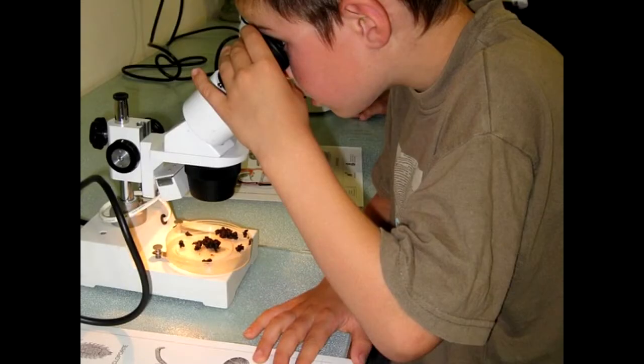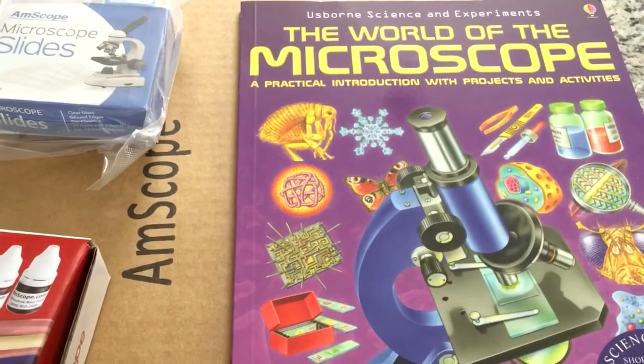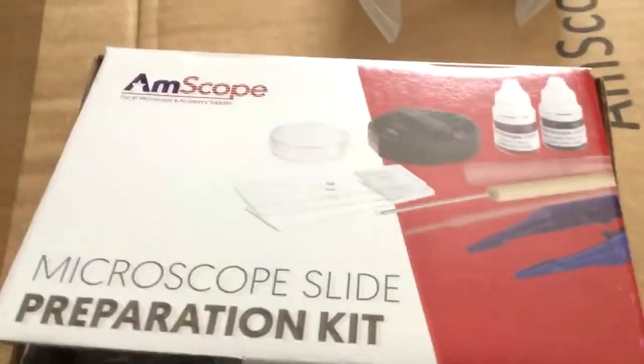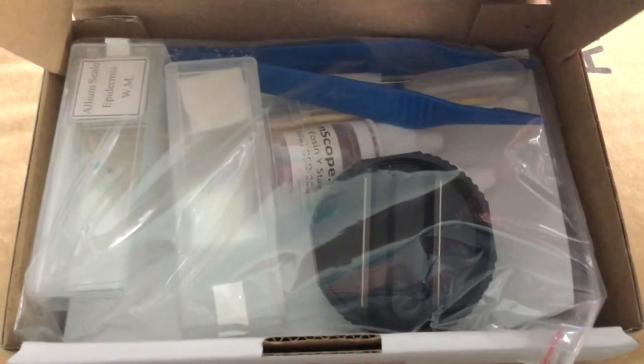You'll find regular microscopes including from Amscope in the $20 to $30 range, but it's worth it to pay a little more for something higher quality. As I record this, the Amscope M162C is $64.50. I paid $84 for the full kit, which in addition to the microscope comes with a book called The World of the Microscope. This book gives all kinds of ideas on how to get the most from the microscope, and also teaches how to make your own slides. The kit comes with the things you need to prepare your own slides, and with 5 pre-made slides.